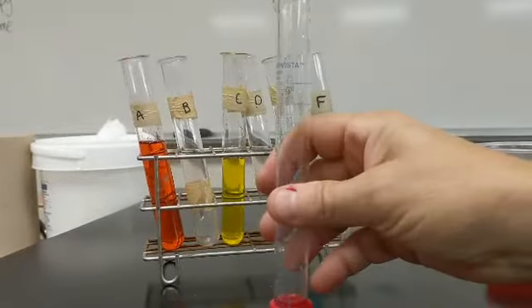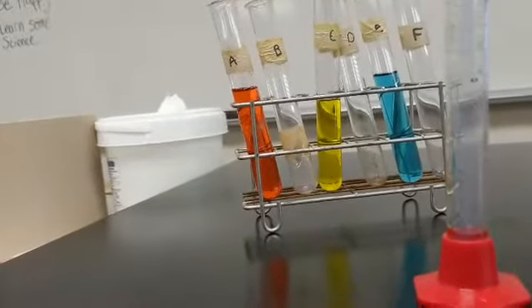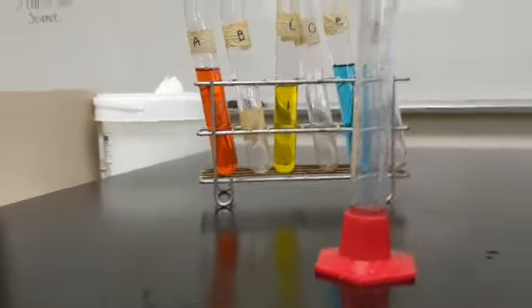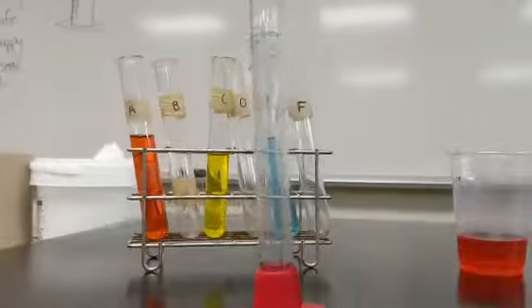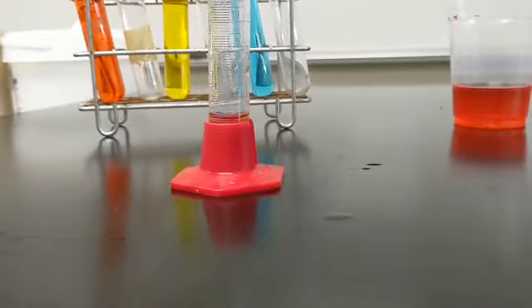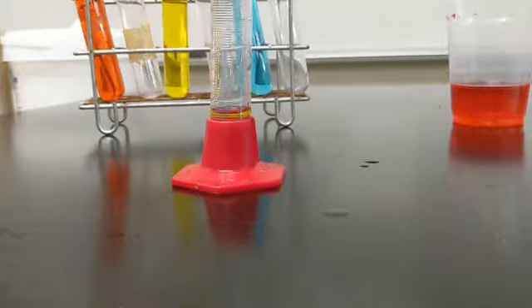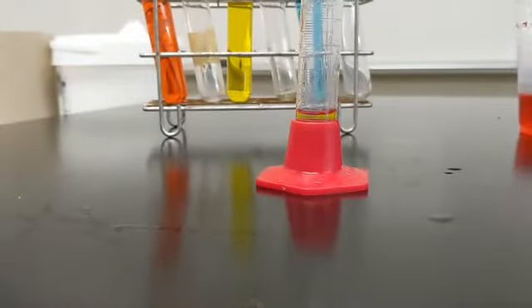Oop. All right. Now we have to add some with the dropper because we've got to get it to 4. I know it's hard to see. Okay, there we go. There's 4 milliliters. Now we pour it into test tube D.